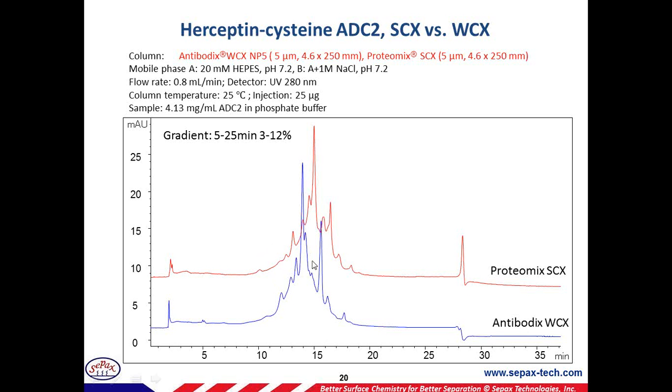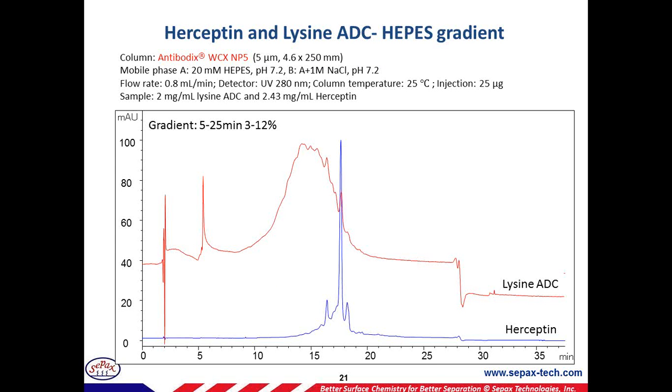For really understanding what those peaks are, fractions can be collected, and then further doing reverse phase for the peptide mapping to determine what are the changes caused by the antibody drug conjugates, or during the storage, or during the process, what happens to the ADC molecule. And of course, we are talking about cysteine ADCs and lysine ADCs, as I mentioned before, with each lysine site conjugated to the drug, you will lose a charge, and it doesn't really resolve well a lot of times on the IEX here.